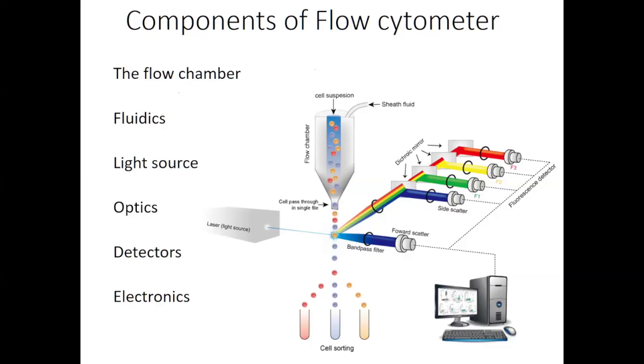Sir, is there anything like this? The sample has to have this much of total counts. In case of cytopenias, when the total count is very low, can we take that sample for flow cytometry, or is there any limit? Yes, you can. Now, I'll tell you one instance where you cannot take the sample when the count is very low.